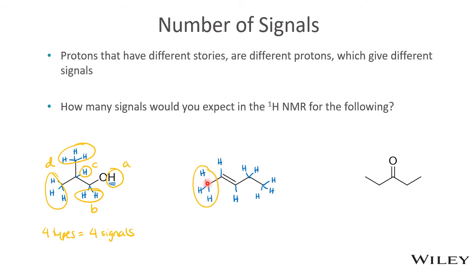These 3 are bound to a carbon, which is directly bound to the double bond. So these guys are 1 bond away from our double bond. These 3 are different than these 3 because these 3 hydrogens are 2 bonds away from our double bond. So they have different descriptions, which makes them 2 separate types. So we'll go ahead and label A and B.